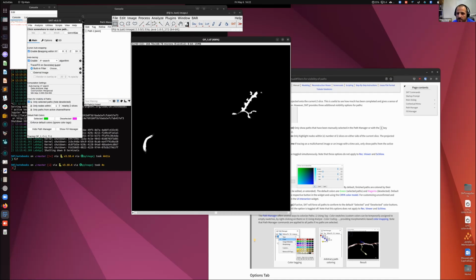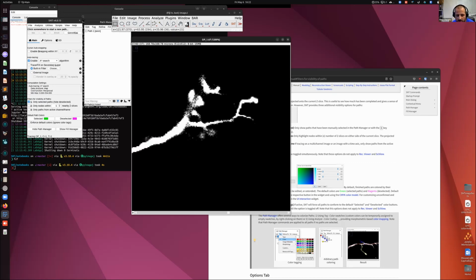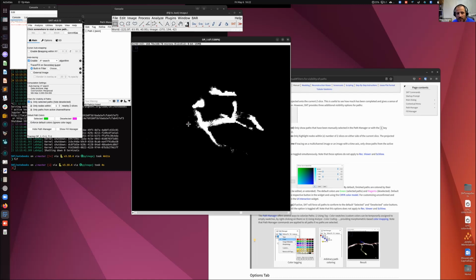The problem there is that there are always going to be locations, such as this gap there, where it gets very dim very fast. There are locations in this arbor where no matter which filtering operation you do, you are going to lose some signal. And then it becomes an issue because you are losing access to the raw data. And so the trade-off that we start using here is what we call a secondary layer.